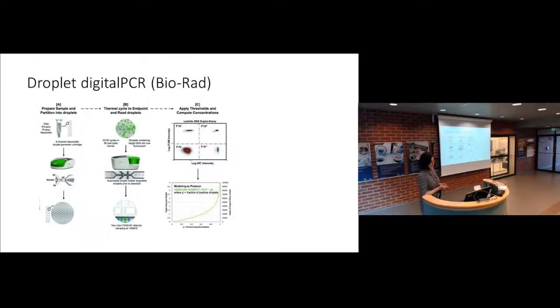Bio-Rad has this droplet digital PCR, and has had it on the market for years already. And we have one or two machines at least in Meilahti for this.